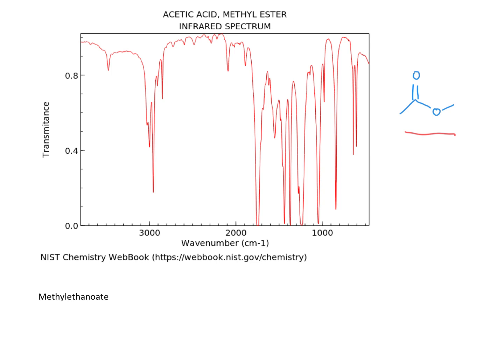Now, please know with mass spectrum, IR, NMR, I will give you a chart to read so that you can see where local peaks should be. Now, I'm going to go from what's in my head on this video, but you can reference some spectra chart, okay? What I notice immediately about this spectra is right here.